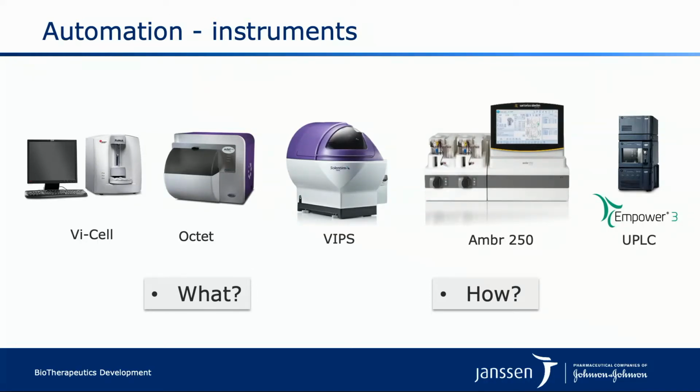It's easy to say we can export and import all the information, but that probably also creates some chaos in the system, and might not be easy to parse at the end. Another question is how we should do that. Every instrument has a different format, and it requires individual attention to export or link to LabKey. But this is our end goal that we're working on.